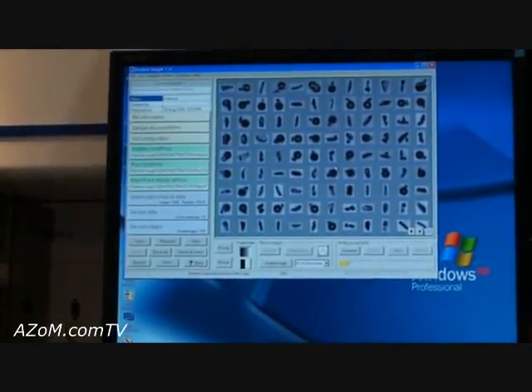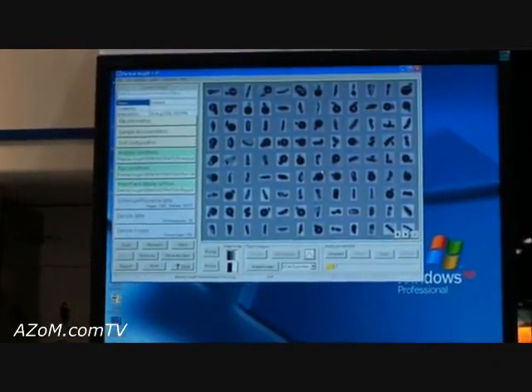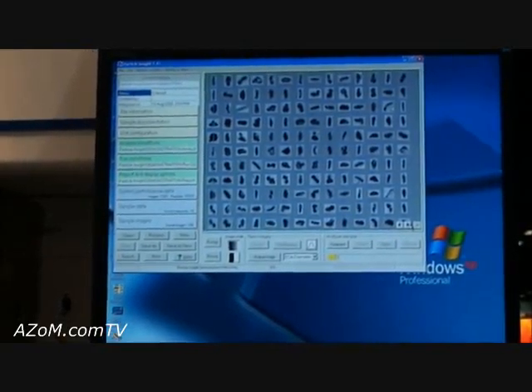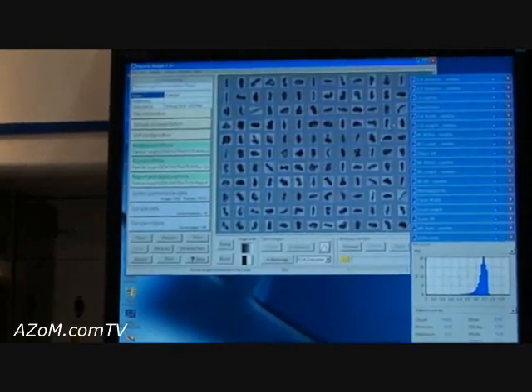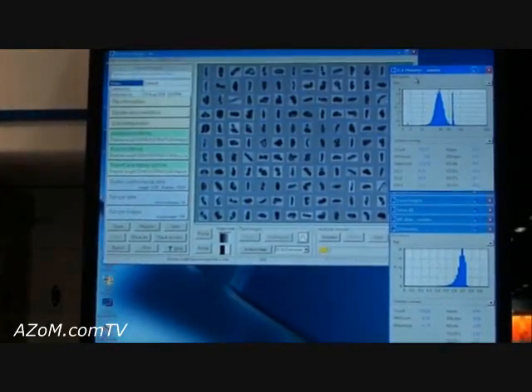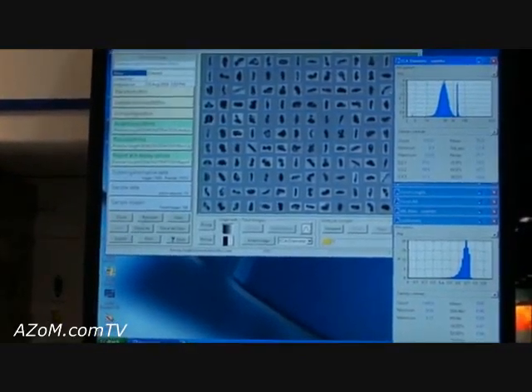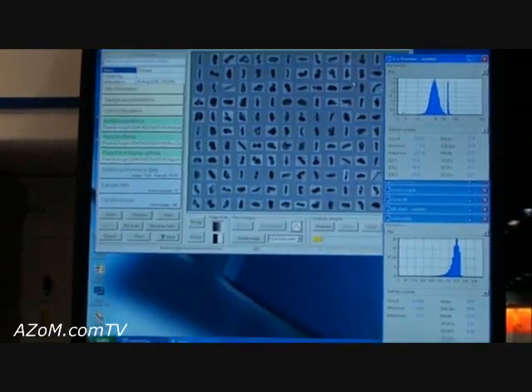So overall, very powerful. It's all on the fly. It does it as it's being analyzed, so no need to wait after the analysis to actually process your data. It'll do it all live. You have all the statistical measures you would normally see in any kind of a quality control instrument. Automatically downloads to Excel, and a number of different reports you can run.